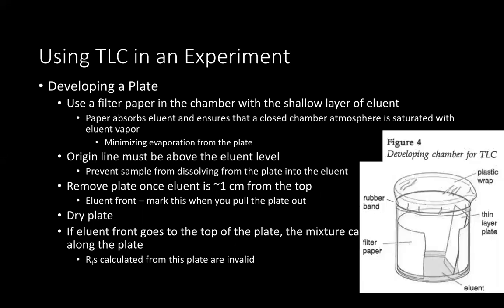So in the lower right-hand corner on this slide, you can see an image of the developing chamber for TLC. You see the filter paper. It doesn't always have to wrap around this much. I like to use the big filter paper that we use for fluted filter paper. Cut one of those in half, and then you and the person at your bench can split the paper.